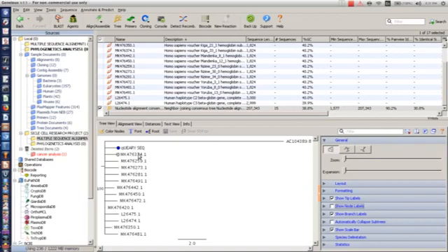Now remember that we have what we call gap penalty, which was 10, and then we increased it to 3, which is 15. So this is trying to tell us that it created a 15% gap penalty, so that any similarities within the range of 15% are treated as 100% similar. So all these sequences are 100% similar with our query sequence, but the outgroup is actually very, very far away.